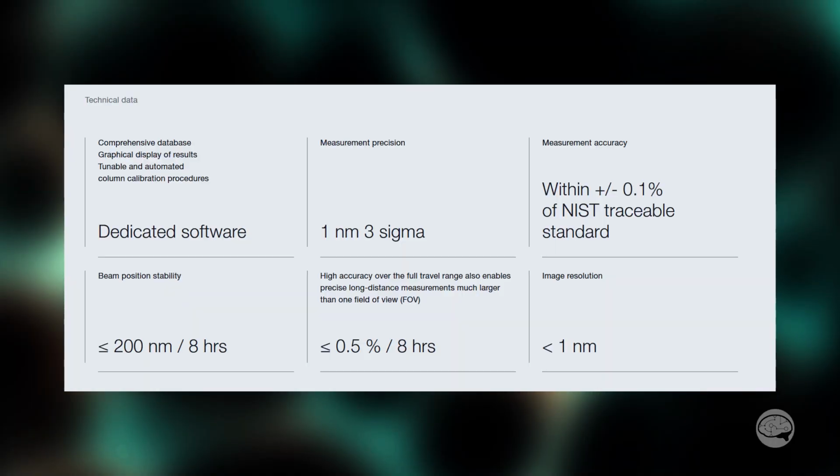So a very accurate stage. It's also self-leveling with a laser height sensor, so you can really speed up your autofocus time because the sample will level for you. And those things allow the tool a high degree of automation.